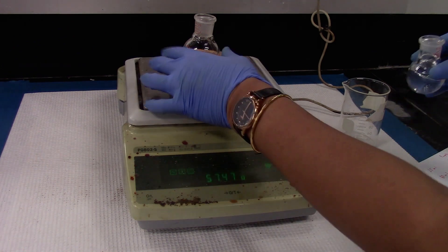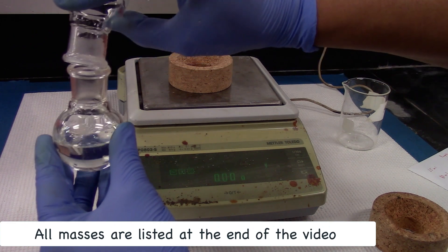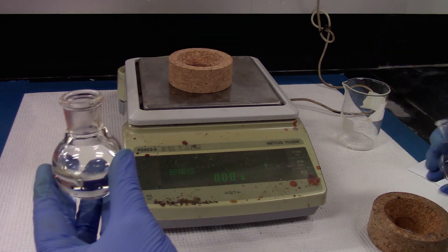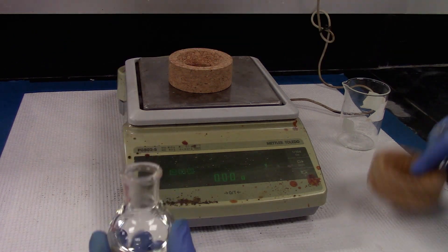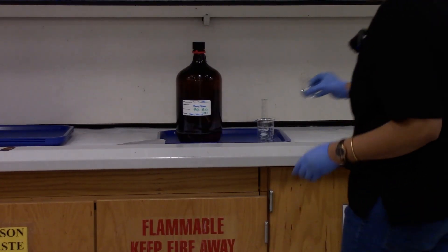Once done, you can combine these two liquids and put it back in the beaker you got it from. Since it's a mixture, it can be reused.